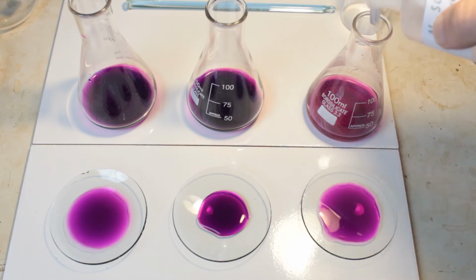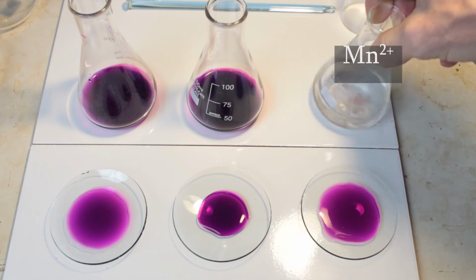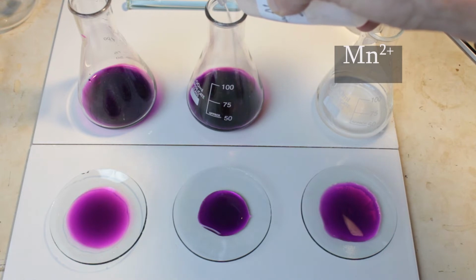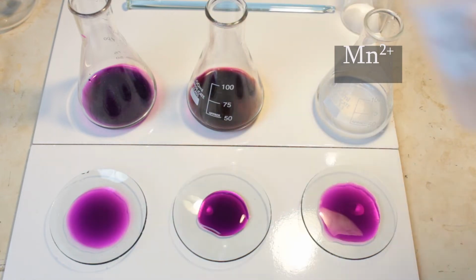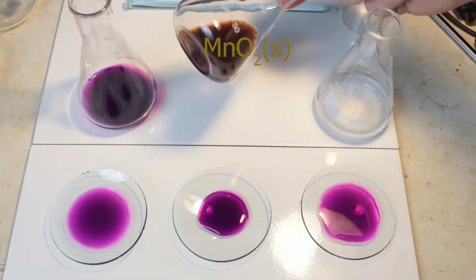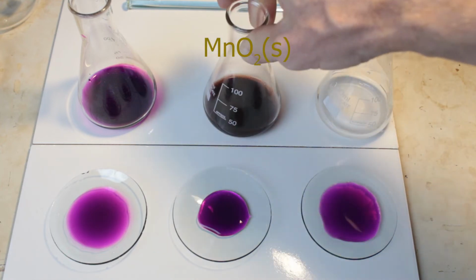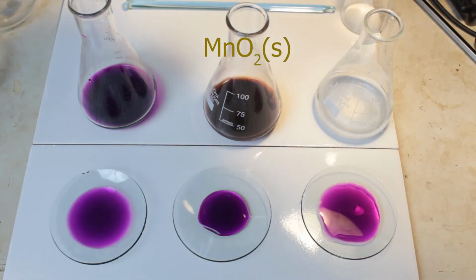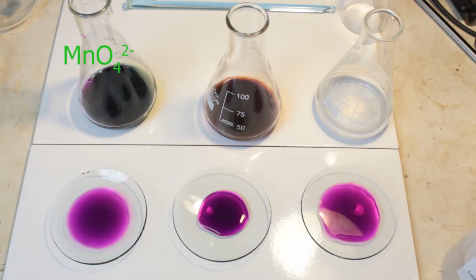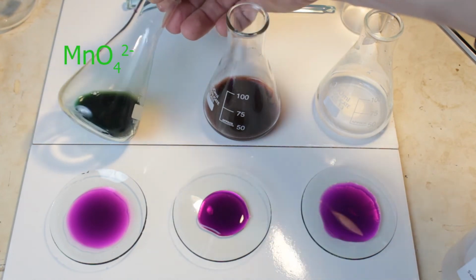Yeah, it was not enough of it, but now you see manganese 2+ ions, they're virtually colorless. Here we put it in the pH 7 conditions. We have a distinct brown precipitate. That's manganese 4 oxide, which is solid. And on the left you see that the color actually changes into green. Surprisingly, it's manganate 6 ions.